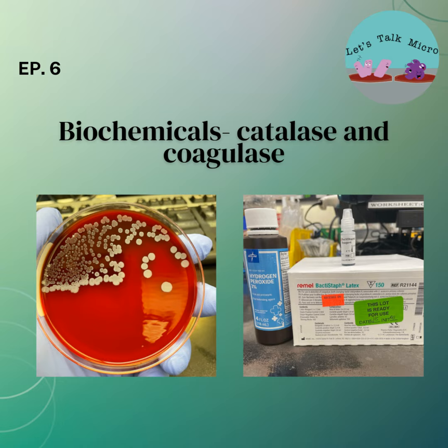So do not assume that just because something is white, it's gram-positive cocci. That's very dangerous. You can make mistakes, you can get in trouble. And most important of all, you can put your patient in danger. There are different treatments. There's a different significance of gram-positive cocci versus rods versus yeast. You treat them differently.